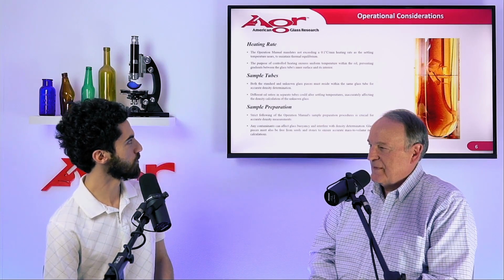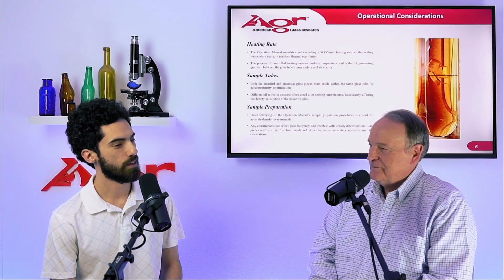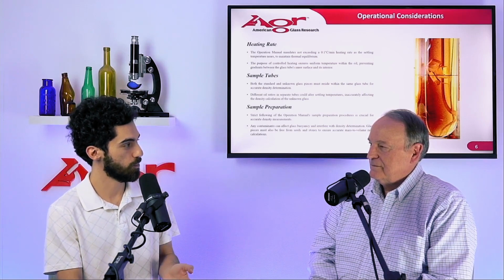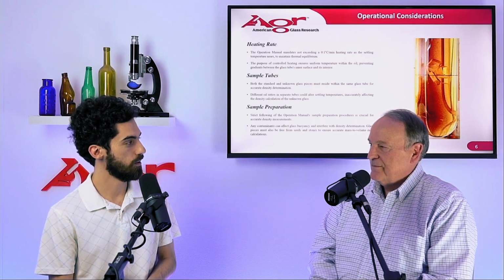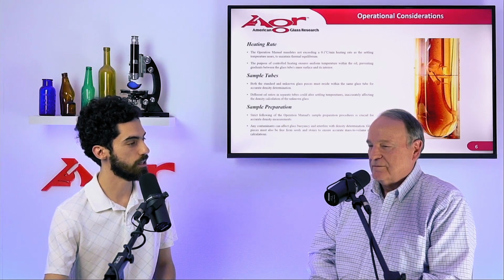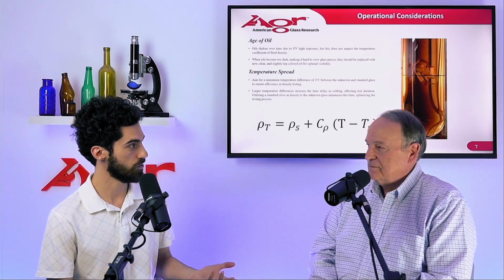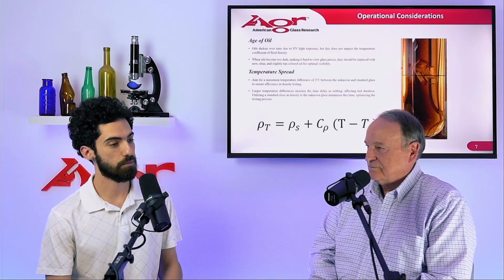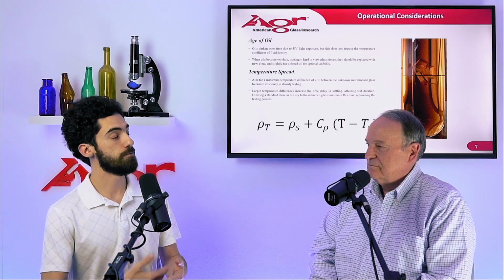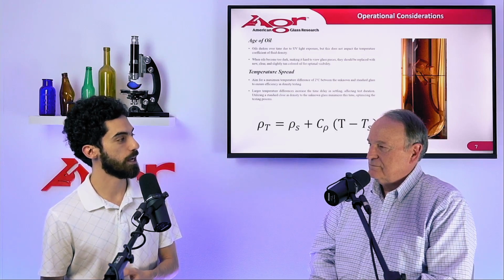So I think that covers most all of our considerations. I don't know if there's too much else. I know this, like we said at the beginning, is a fairly simple piece of equipment. What it's there for is to detect the density, and that changes on potentially a daily basis, which is why we have those control charts, as you called them, right? And that's pretty much it. We're just looking to find an efficient method of monitoring our chemical composition over time via density.